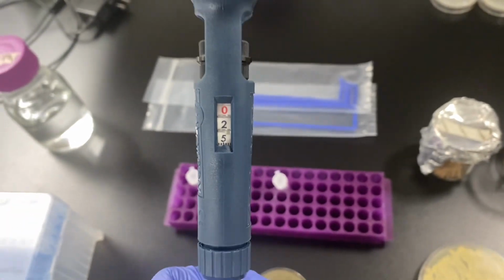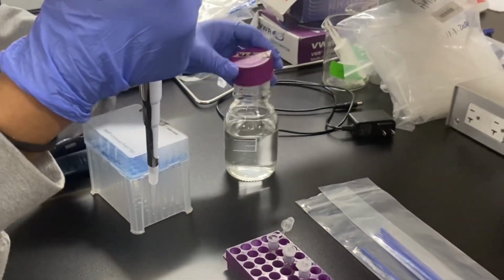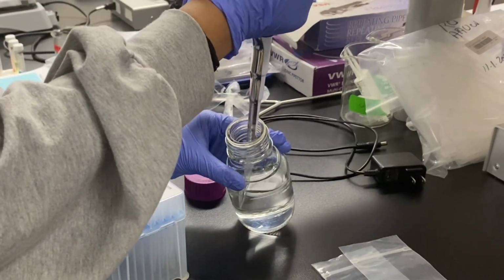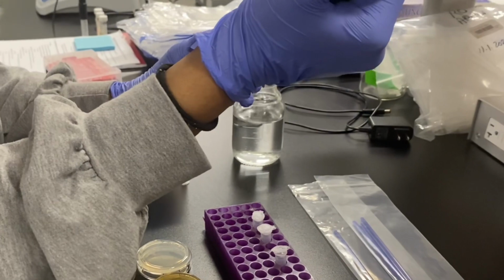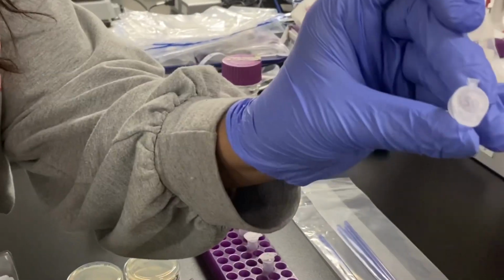Adjust the P1000 micropipette to 0.25. This will allow you to get 250 microliters of solution. Attach a fresh pipette tip and add 250 microliters of sterile water to your first tube or tube S0.